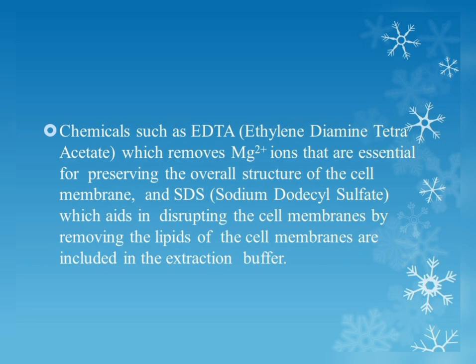Next, chemicals such as EDTA, ethylenediaminetetraacetate, which removes the Mg2+ ions that are essential for preserving the overall structure of a cell membrane, and SDS, sodium dodecyl sulfate, which aids in disrupting the cell membrane by removing the lipids of the cell membrane, are included in the extraction buffer.